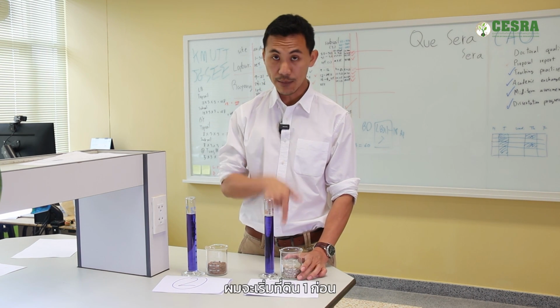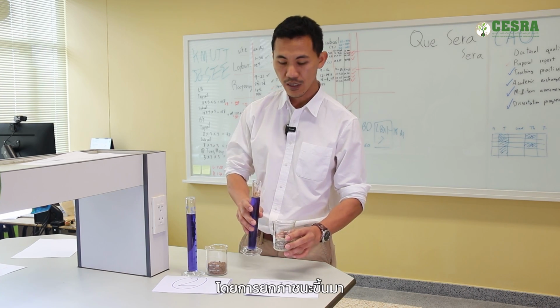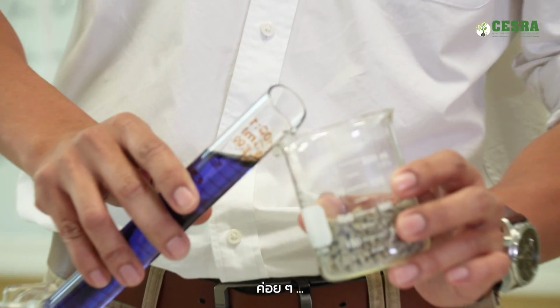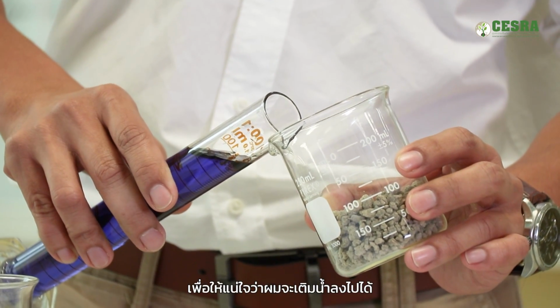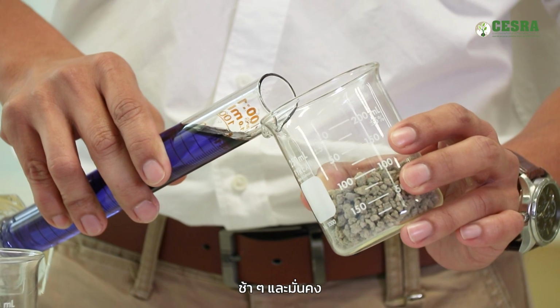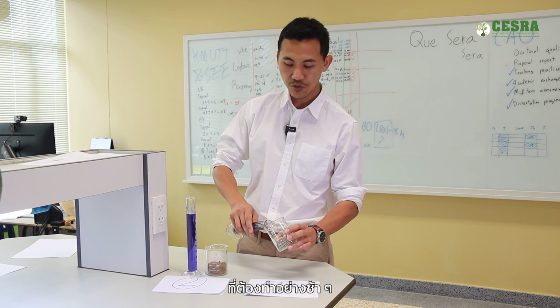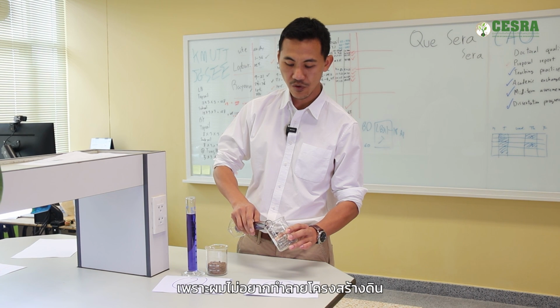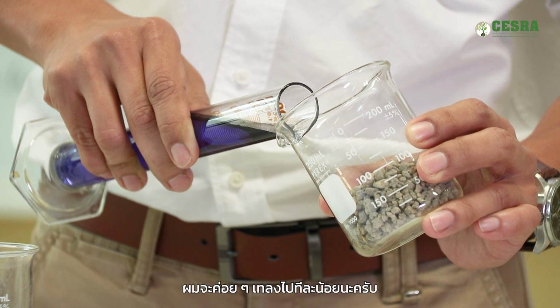Now I'm going to start with number 1 first. What I'm going to do now is just lift the container here a little bit, and I will turn around just to make sure that I can add water slowly and really smoothly. The reason I have to do it really slow is because I don't want to destroy the soil structure, because not just the structure gets destroyed but also the pores. I've got to do it bit by bit.